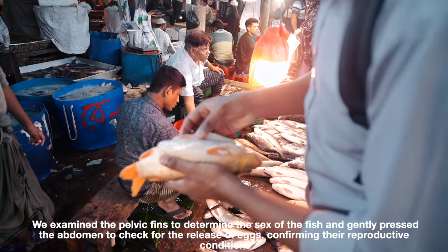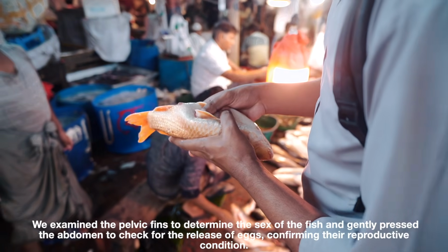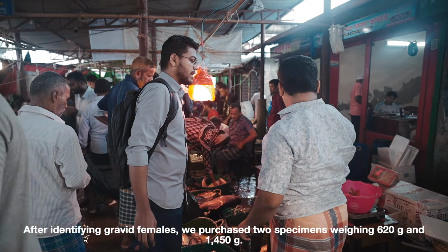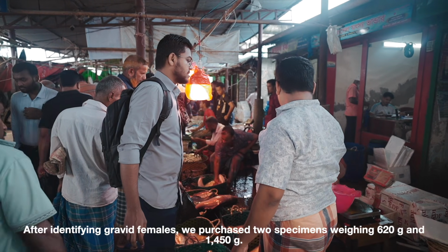We examined the pelvic fins to determine the sex of the fish and gently pressed the abdomen to check for the release of eggs, confirming their reproductive condition. After identifying gravid females, we purchased two specimens weighing 620 grams and 1450 grams.